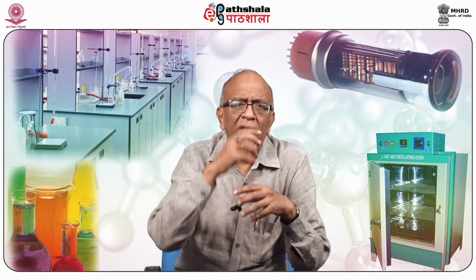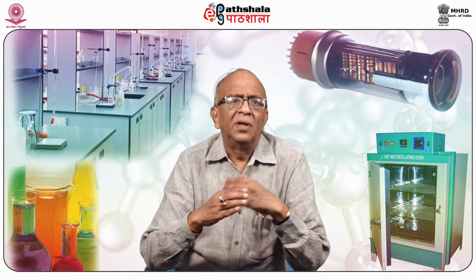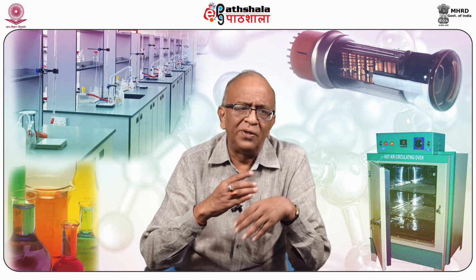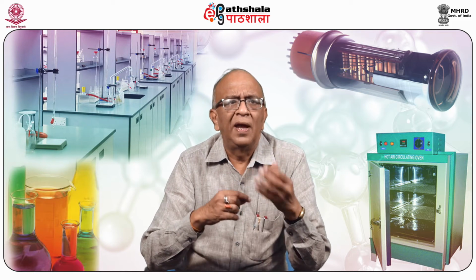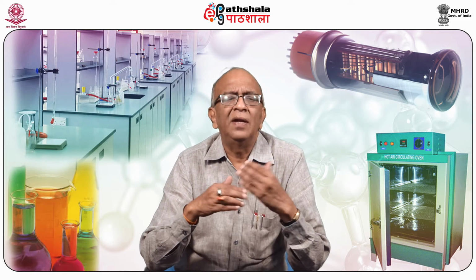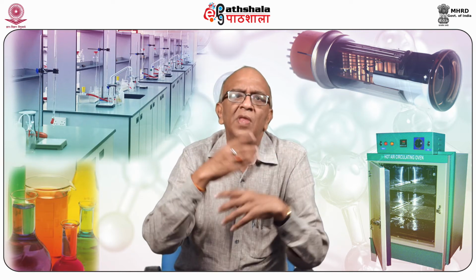From that, the clue was taken and paper chromatography was developed by putting a spot of the mixture at one end of the paper, then developing it in a chamber and observing the movement of the mobile phase.